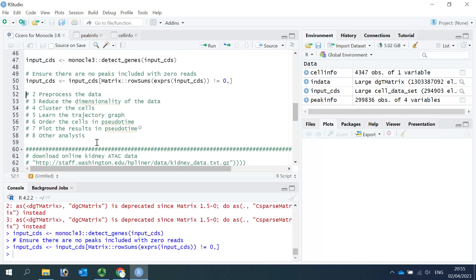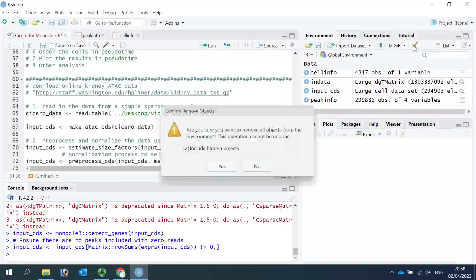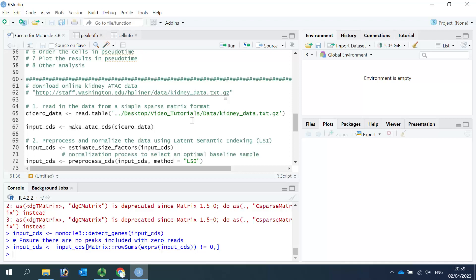I'm not going to use this dataset for trajectory analysis because it's not a good example to show trajectories. For this part, I just wanted to show you how to load the data from the 10x Genomics platform. For the trajectory analysis, I'm going to use the dataset from the online tutorial. I downloaded it already — we can just read the data in. Let's read the kidney data in. Using the kidney dataset as an example, you can learn how to load data from text files.